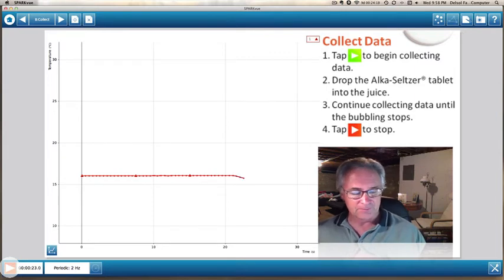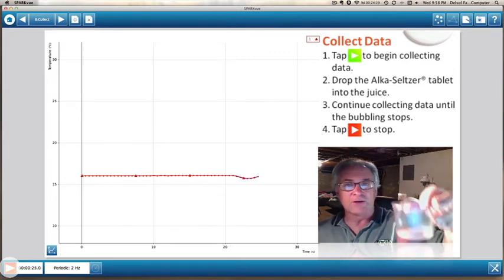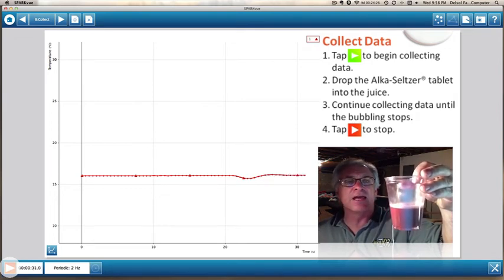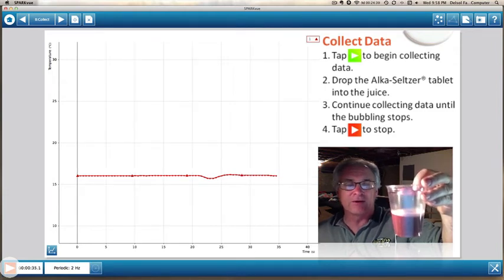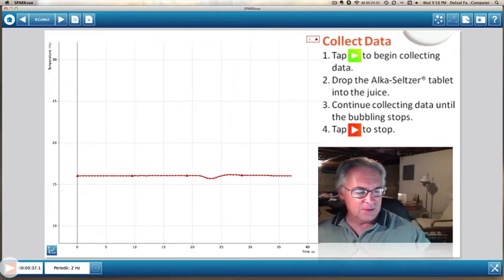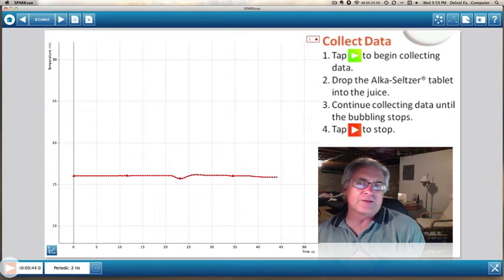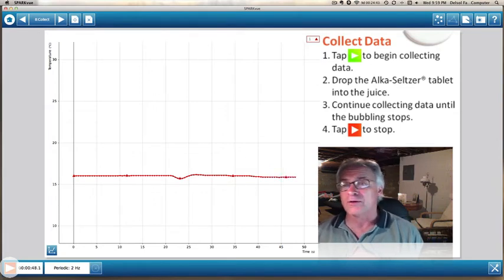And I'm just going to drop it in right now. And now it's fizzing. If you take a look at that, you can see it's beginning to fizz a little bit. Not as much as I'd like to see it fizz, but it's definitely fizzing. And we're going to be recording the temperature. And we're going to let that go. I'm going to set this aside. And we're going to hit stop once it stops fizzing and bubbling. And depending on the kind of juice, if it's cold or if it's warm, it's going to give you a greater or lesser of a reaction.